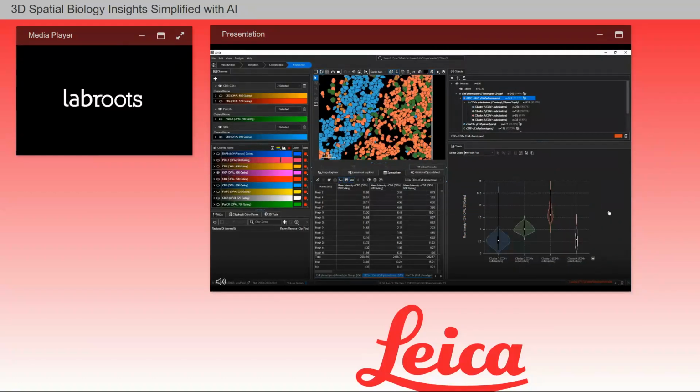The bulge from the violin plot represents the data distribution. And in the center, you have a dot and a bar that represents the mean and standard deviations respectively. When I hover over the plots, you can also see a p-value bar above the chart to indicate the statistical significance between each group. Here is another new feature in Aivia 14.